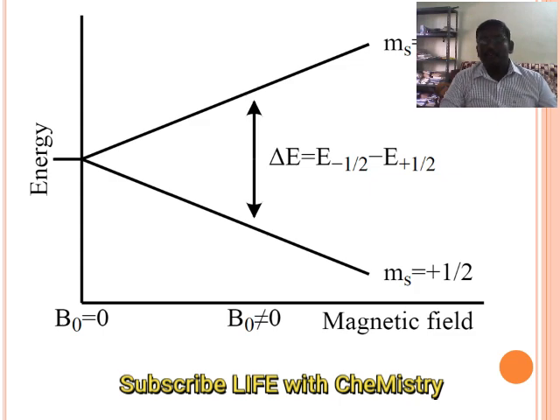The magnetic splitting depends on the strength of the applied magnetic field. Which one is the applied magnetic field? The electron absorbs microwave radiation, which undergoes a spin transition. So that is very important.